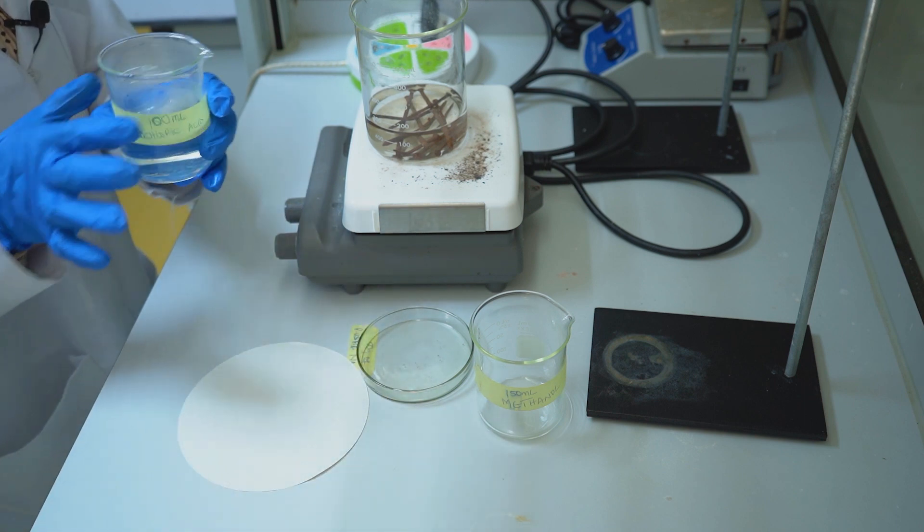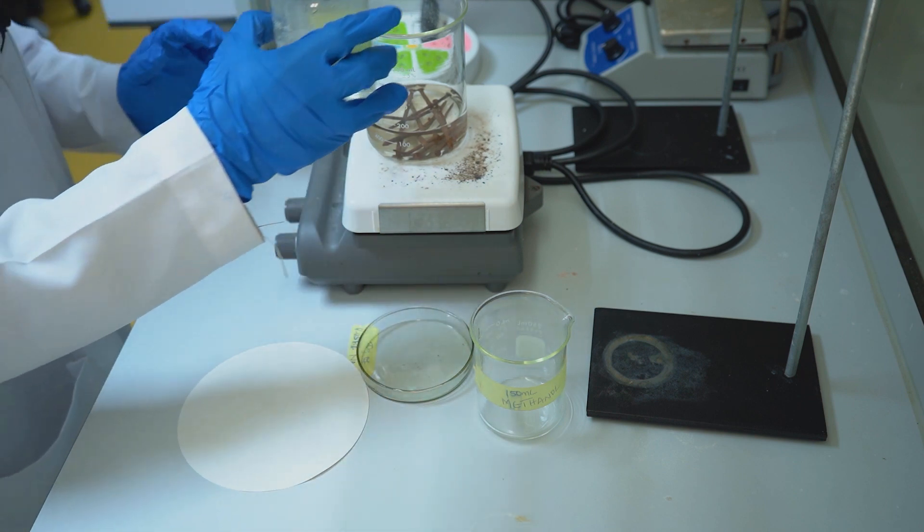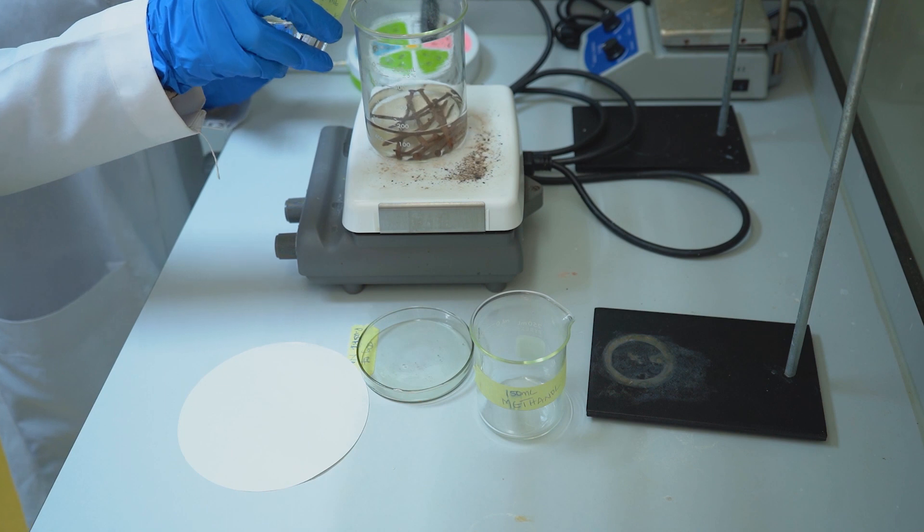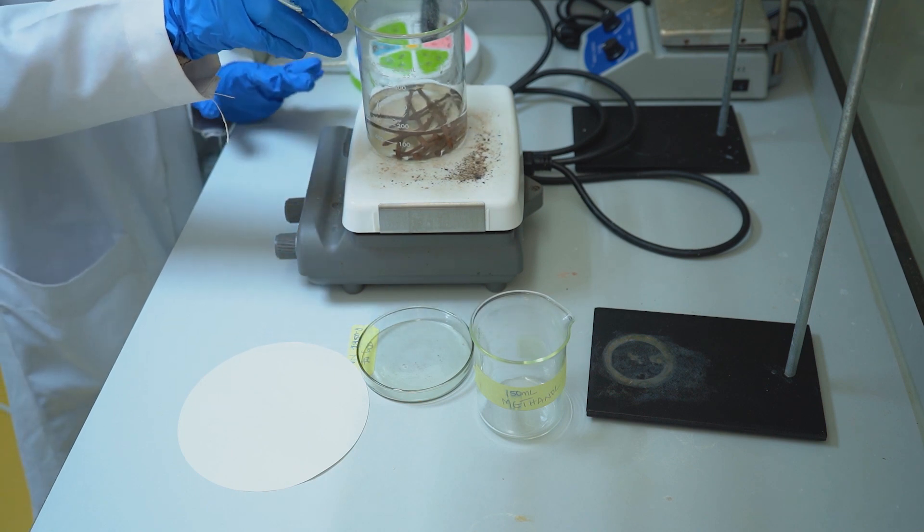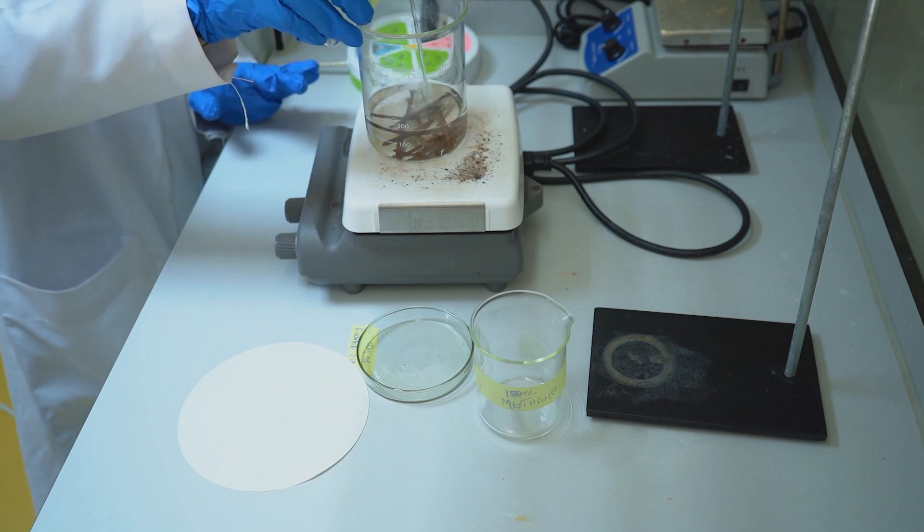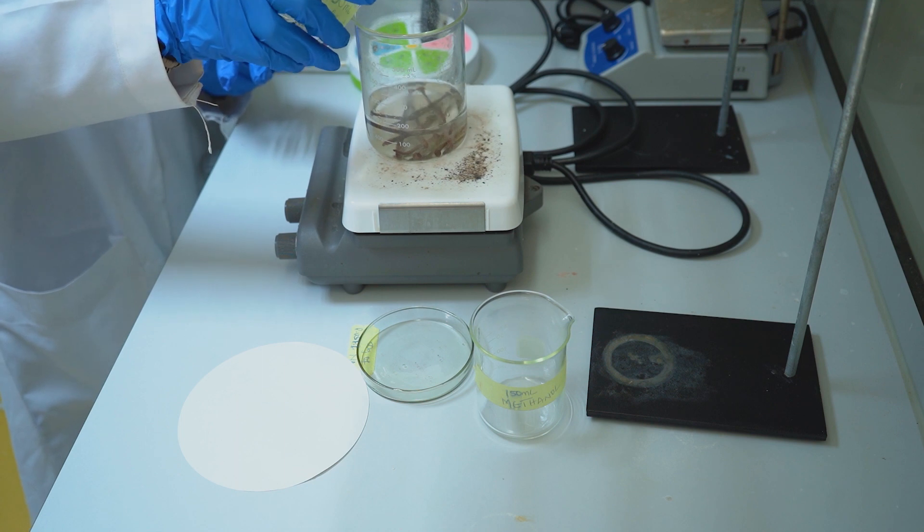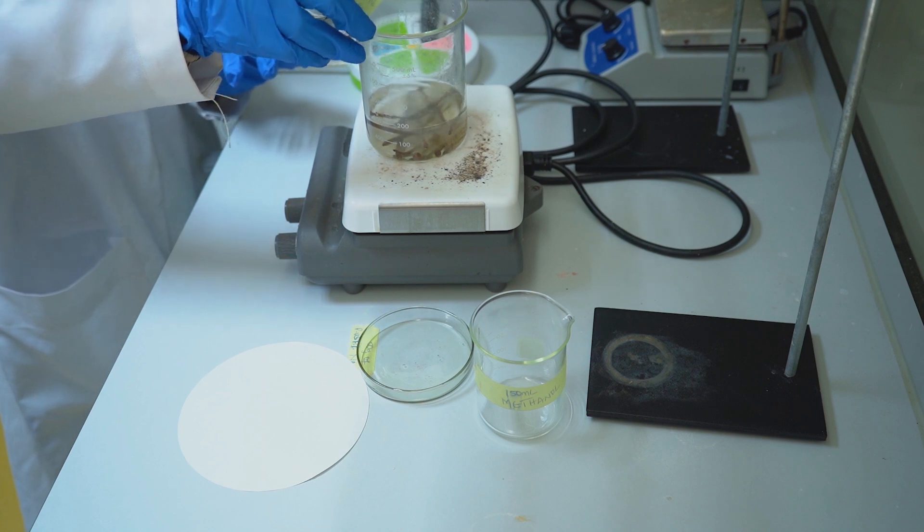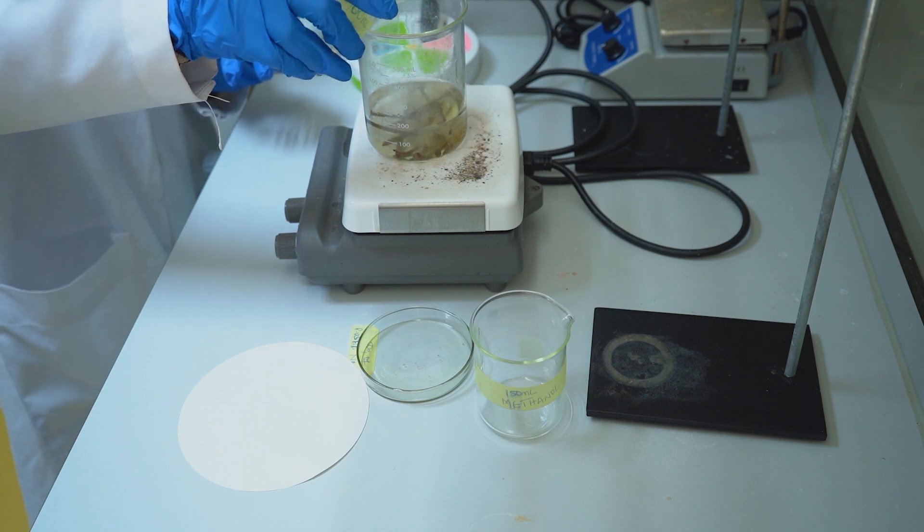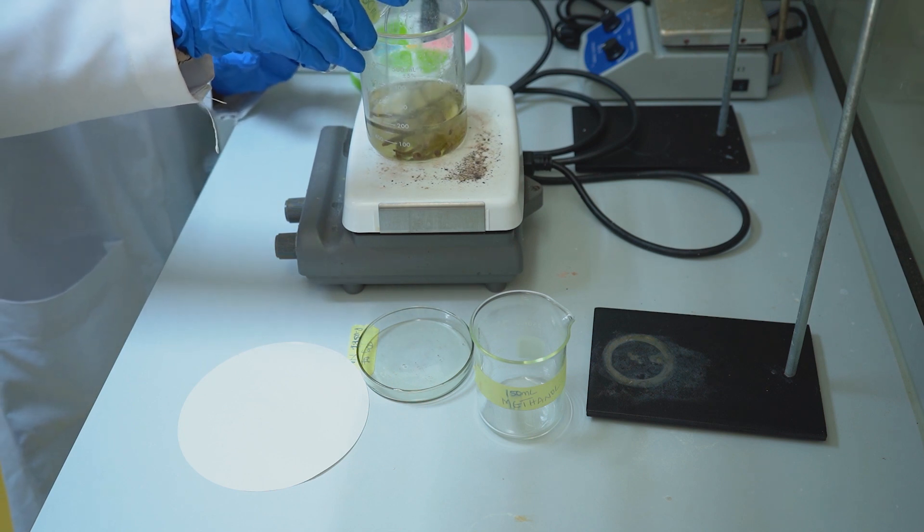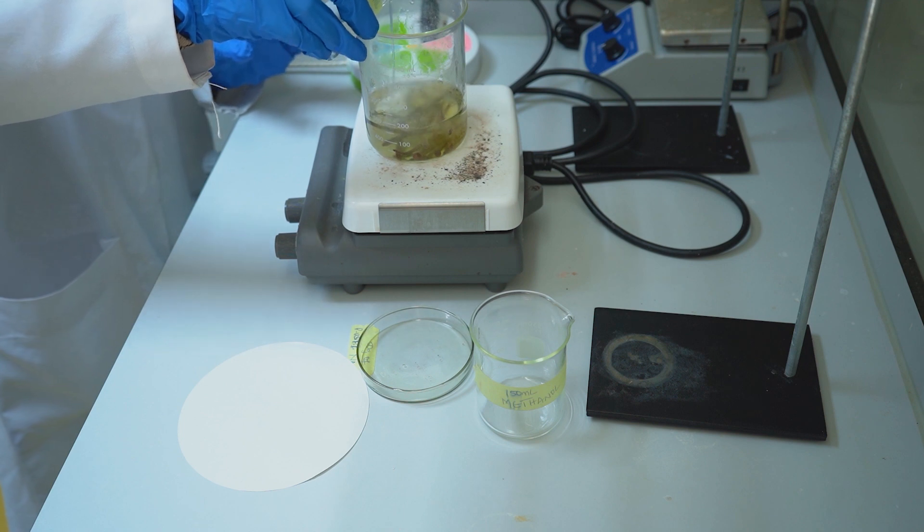Carefully add the 100 ml hydrochloric acid dropwise. Notice some bubbles. The solution is gradually turning into a lemon color.